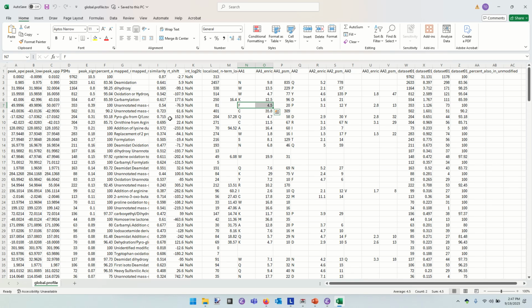I think Chris is getting to a problem that I've alluded to vaguely, but we really need to talk about in more detail. And that is localization. How does the software pin down this location? It does that based on at what point in your known sequence you see a wrong mass shift between two adjacent Y ions or B ions. Okay, so in this case, we look at this particular record for just this row.